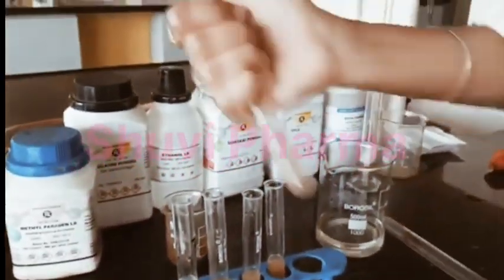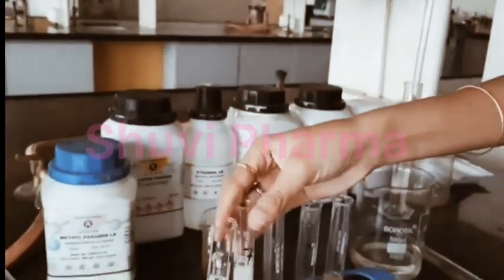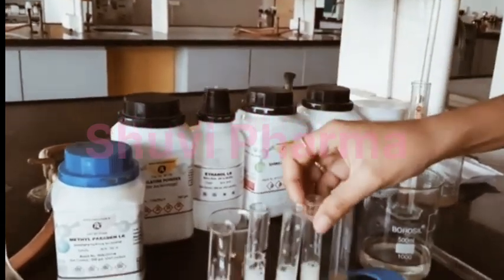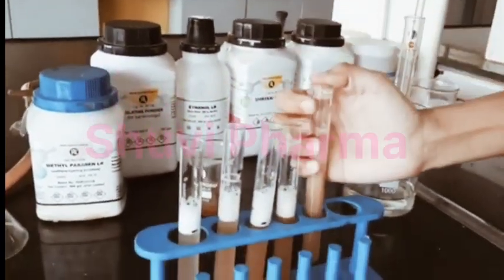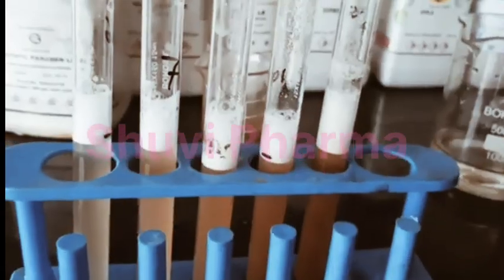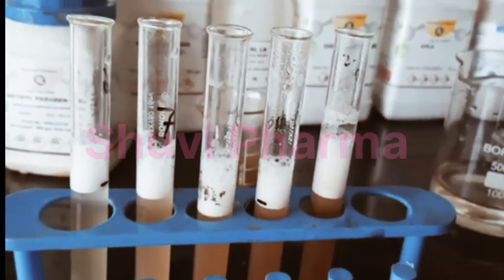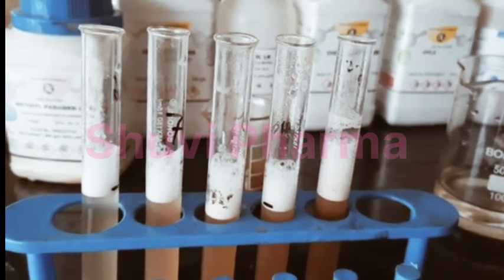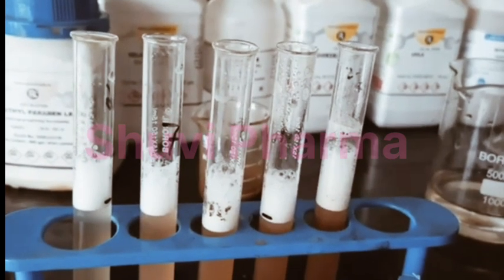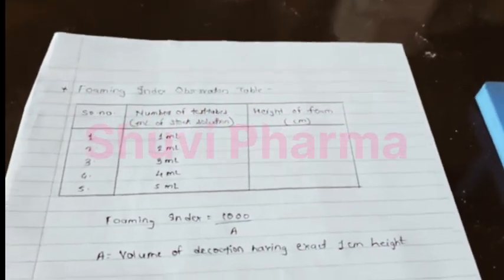Now we will shake these test tubes, okay? And after 1 minute, we will measure the foam in centimeter. So now we will calculate the height of the test tubes.